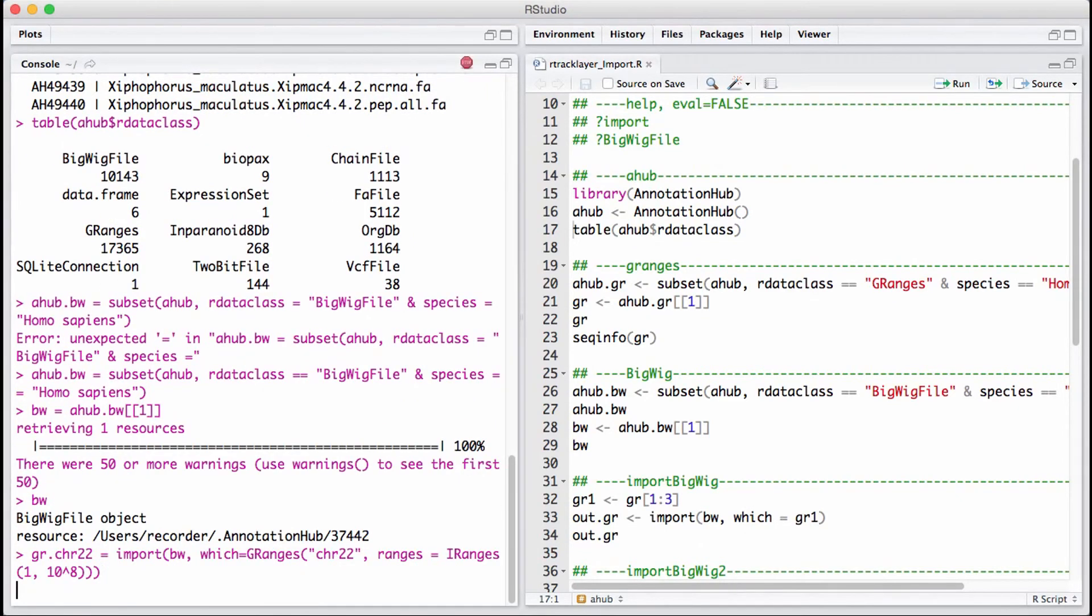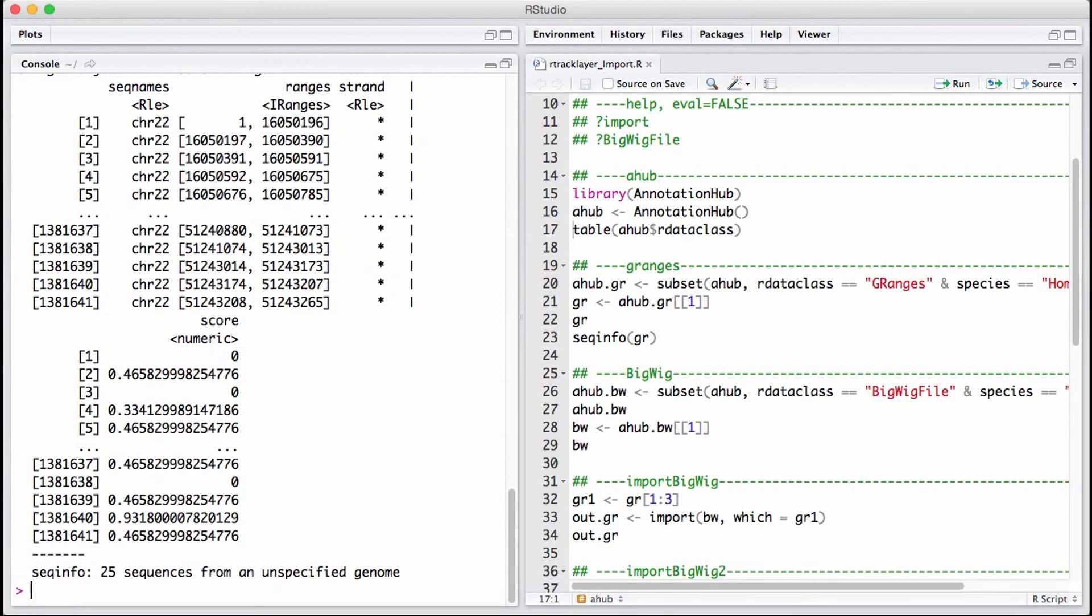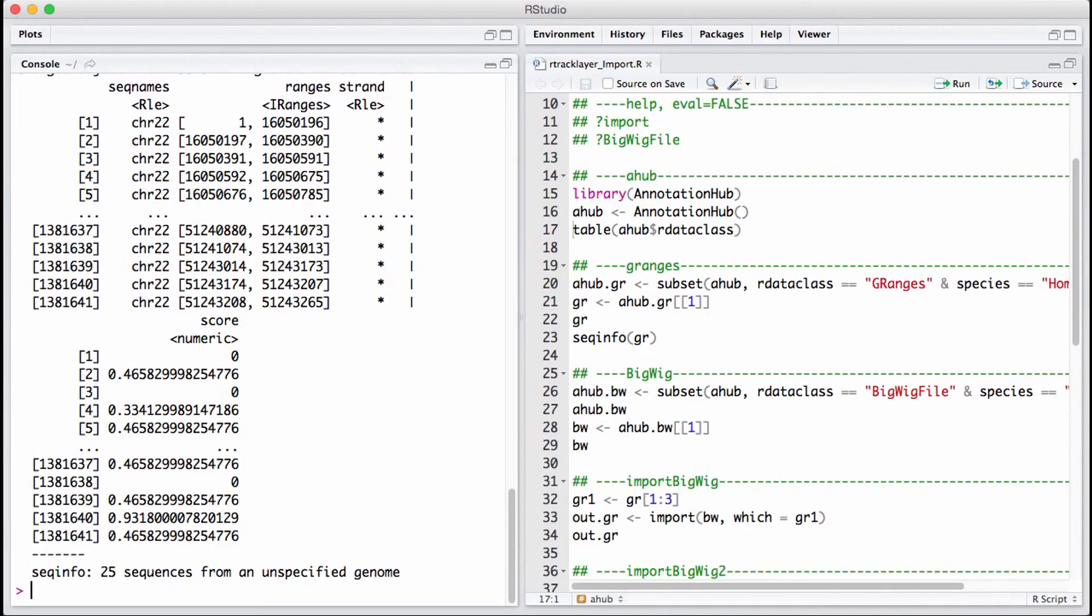Once we have that defined, we can put it in and see what we have. There you go, we get a bunch of GRanges. That's how you import a specific data set from the genome browser into R language. Thank you very much.